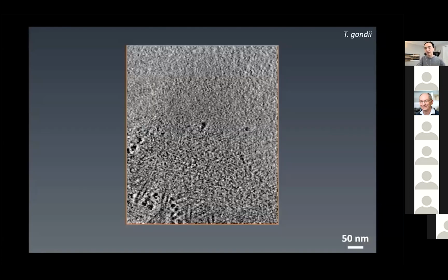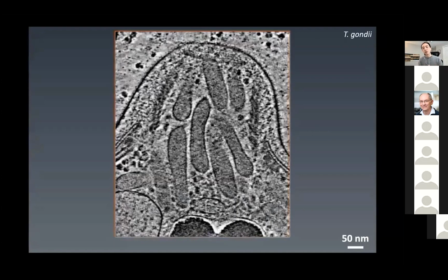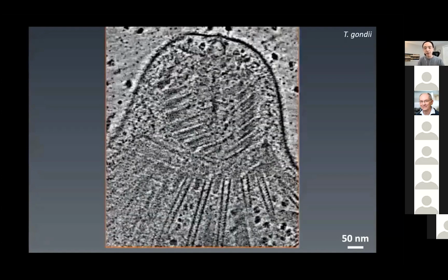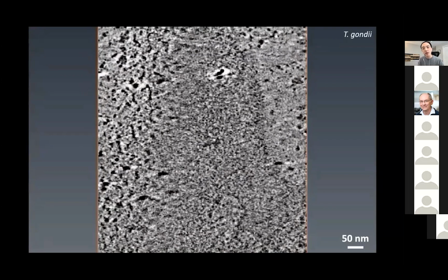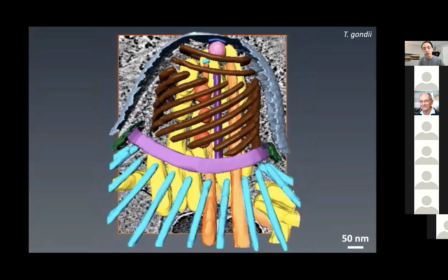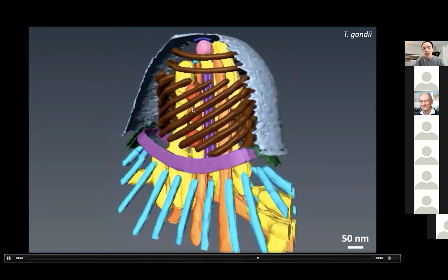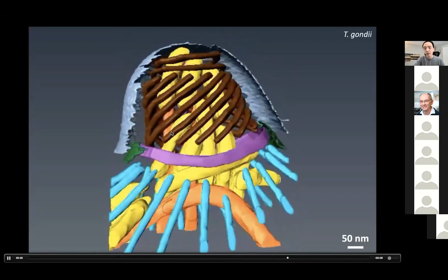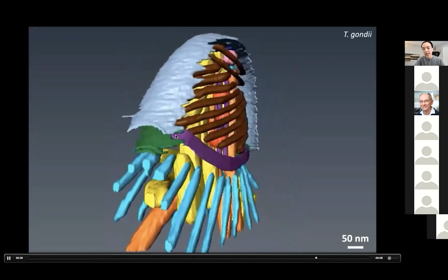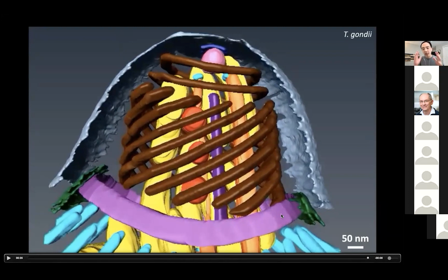And this is the tomogram of Toxo, and slice by slice, we're going through the tomogram, and right away we can also appreciate the structural complexity of this apical region of Toxoplasma cells. In 3D, we were able to segment out different features inside these tomograms. We see similar things, the two rings at the tip of the cell, and this tubulin-formed conoid structure like a cage, the apical polar ring, and organizing all of the subpellicular microtubules. The entire cage is organizing a lot of important organelles, pointing them toward the apical tip.